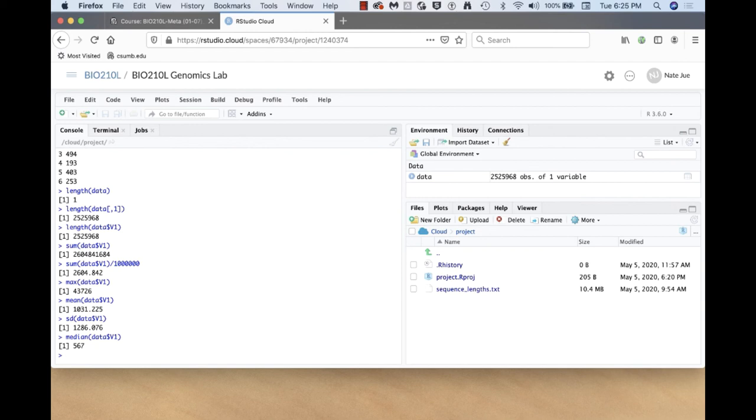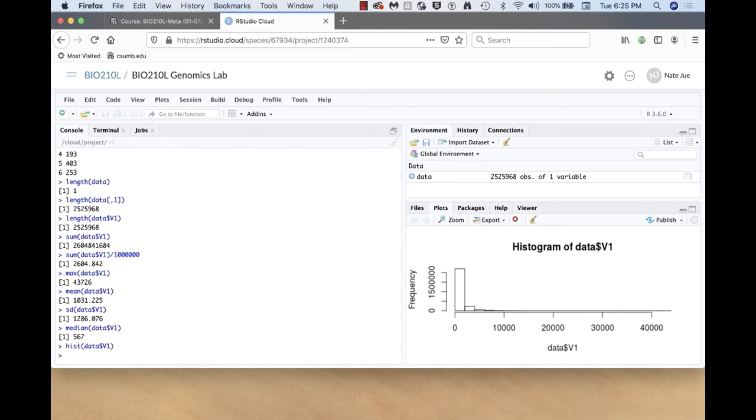So how can we visualize this distribution? A classic way to look at a visualization of data is to use a frequency histogram. And these are very easy to generate in R. So we're going to use a frequency histogram here to take a look at this data and visualize it. And we can see I generated a frequency histogram, and it pops up over here.